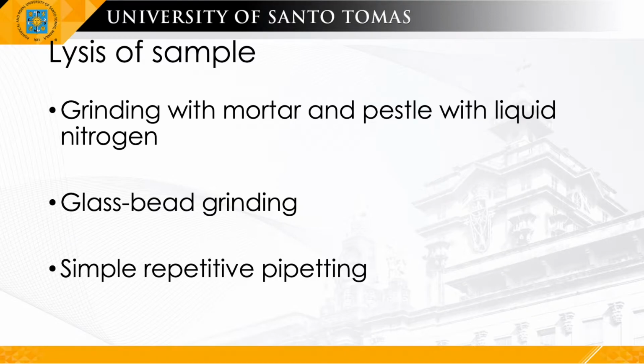So in lysis of the cell or the sample or the source, there are multiple methods we can use, and you're familiar with these, right? Some of them, like grinding, glass beading, or even simple repetitive pipetting, fall under mechanical lysis. No? So here are other considerations. If the source is a plant or an animal tissue, samples are ground in a mortar and pestle with liquid nitrogen, the first one that's in there.